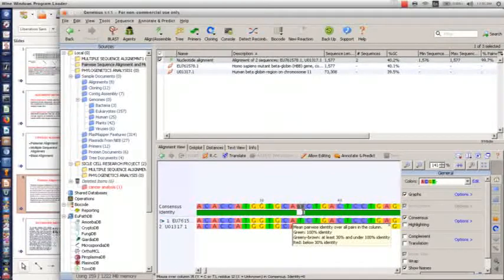As you can see here, we have the mean pairwise identity over all pairs in the column. Green is 100% identity, while green-brown is at least 30%, while red is below 30%. So as you can see here, we're going to look into understanding it.